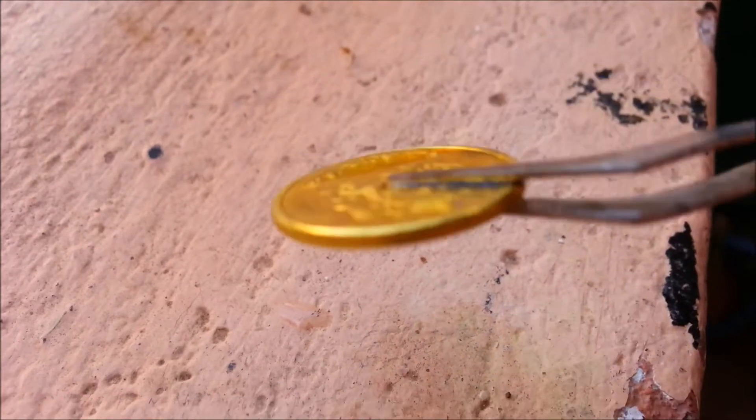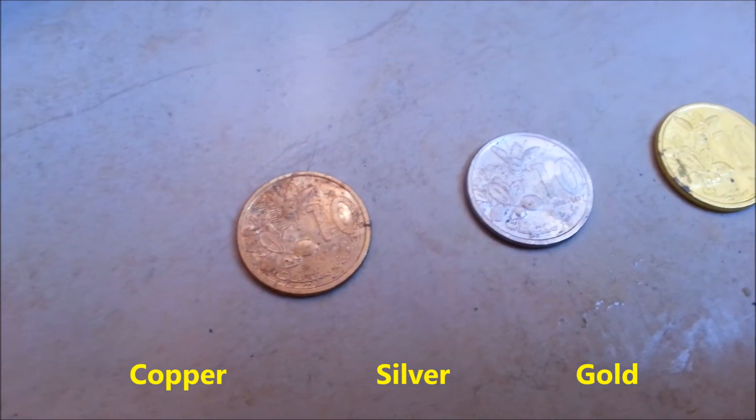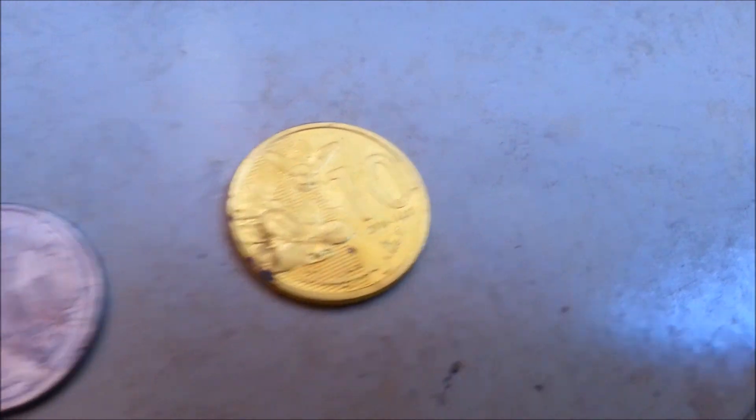We put it into water, and now we can say we've made it. We have a golden coin. You can see the difference between the three: the copper one, the silver one, and the gold one. It's not actually gold — it looks like gold, but it's actually zinc and copper.